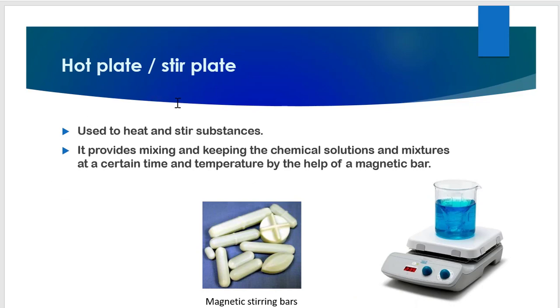Next we have the hot plate or stir plate. This is a heating plate which gets heated as per our setting — for example, if we set it to 60 degrees Celsius, it will heat up to that temperature. It also has a magnetic stirrer base, so we can do two things simultaneously: heating and stirring of the media. For instance, if I have put NaCl in water and want to stir and heat it simultaneously, I place the beaker on this plate and it will stir using the magnetic bar while the hot plate heats the contents.